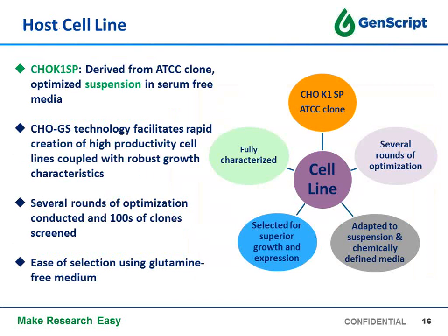As I mentioned before, the cell line was derived from the ATCC clone. After that, we went through several rounds of clone optimization and screened over hundreds of clones. And finally, we optimized the suspension CHO-GS clone in the serum-free medium.